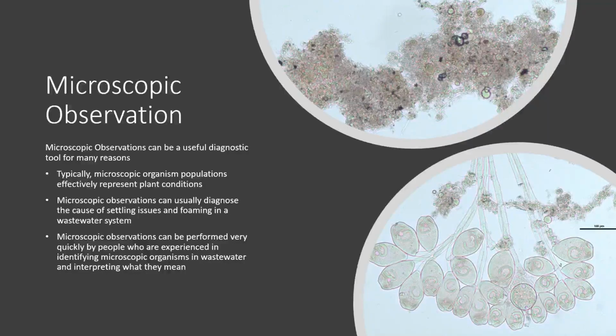Another nice thing is if you have somebody who's experienced performing microscopic observations, you can get a really quick turnaround time and have results quick enough that you can start to address them on site as efficiently as possible.